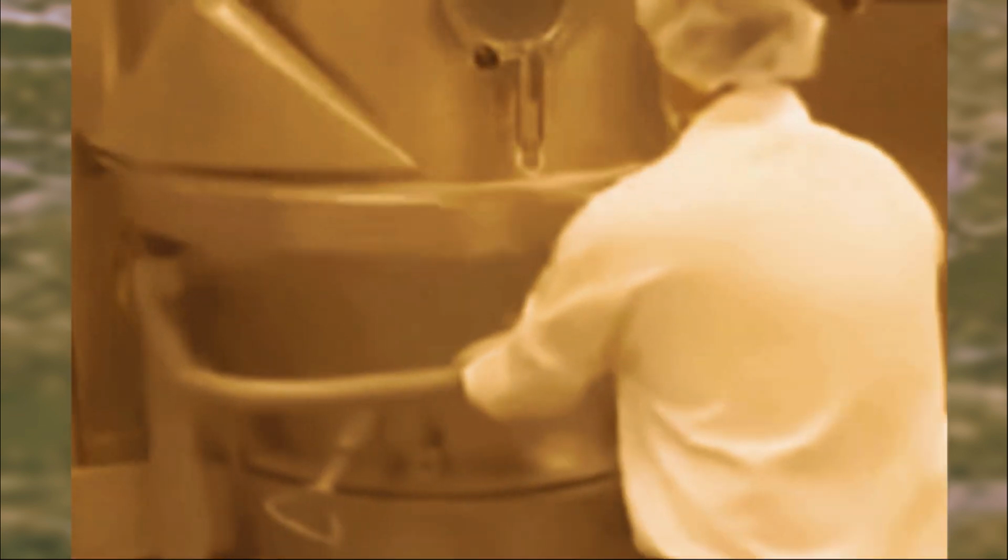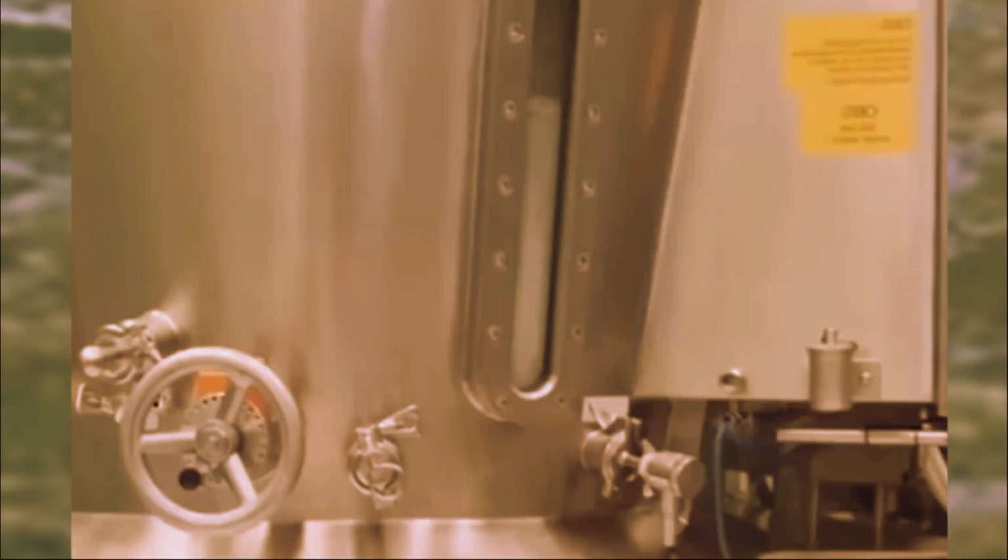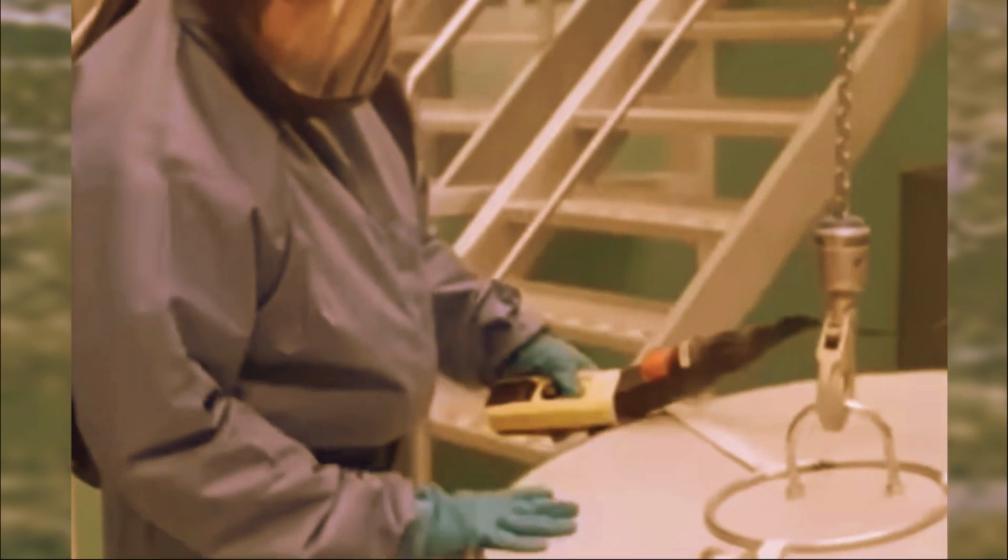Step 6, milling and granulation. Refined further, it's time to toss it into a milling machine to make sure all the particles are the same size. In some cases, especially for tablets, the dried aspirin may be milled to get an even size. We have now reached the point. Step 7, tableting or encapsulation, where we give the pills their shape or make capsules with this powder.